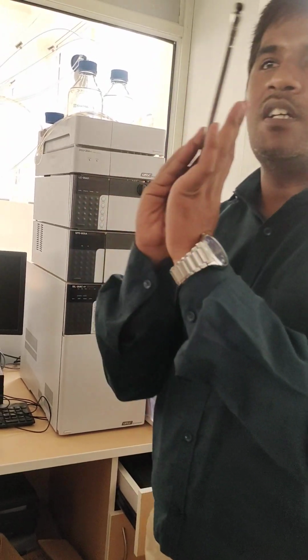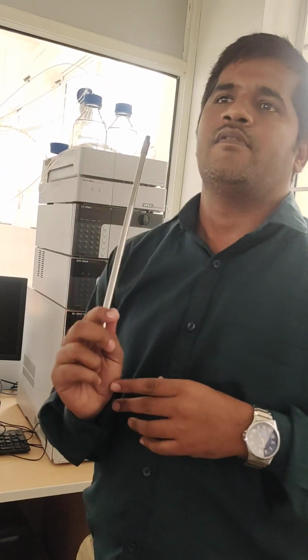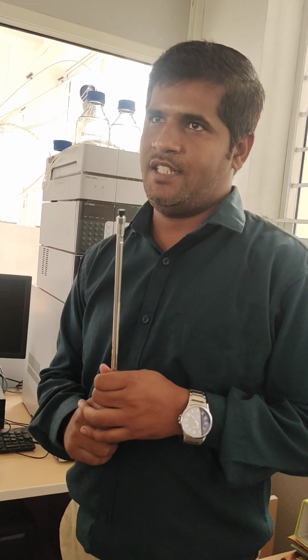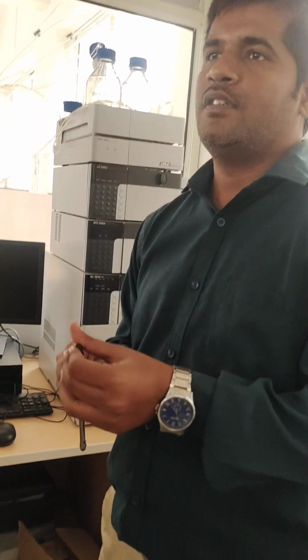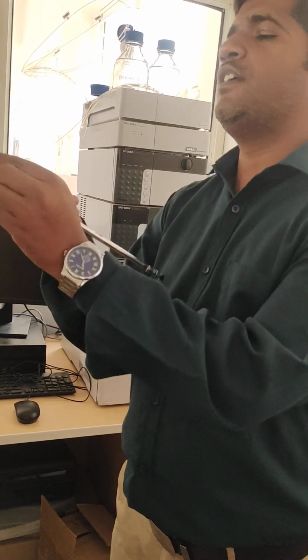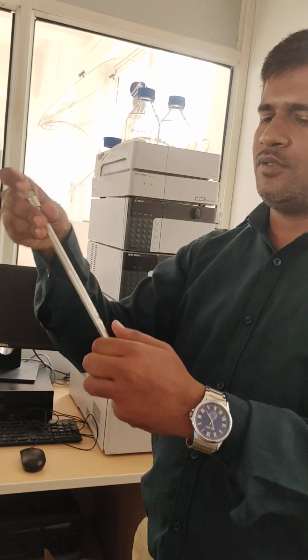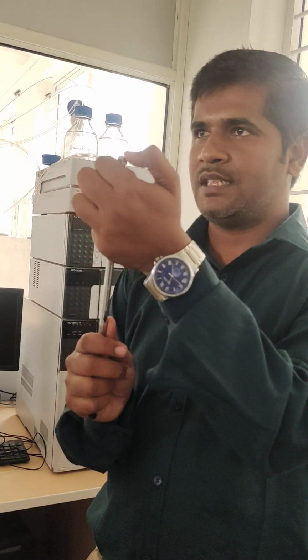Now we have to see the column nature. The length is 25 centimeter. What is the length? 25 centimeter. If you convert it into mm, it is 250 mm. Yes, 250 mm length is there. Then the internal diameter we also have to check. This is the internal bore, because we have to supply the sample through that particular column and run it. The internal diameter of the column is 4.6 mm. What is the diameter? 4.6 mm.